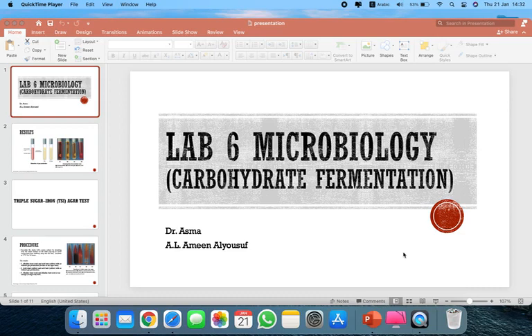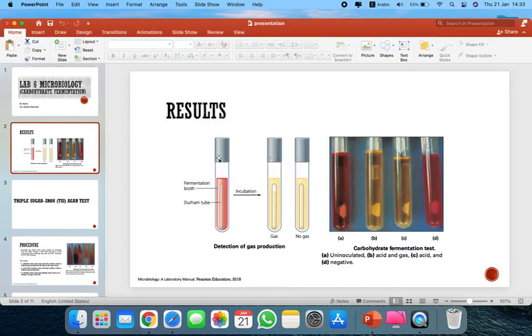Good morning, everyone. So today we will discuss and learn about lab 6 of microbiology. This will actually be multiple sections, and we will start with the first section, which is about carbohydrate fermentation. First of all, what is the principle behind carbohydrate fermentation?